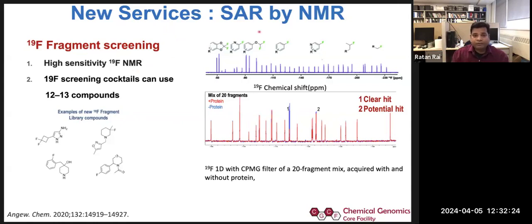So what do you mean by fluorine label? It means one of your sites has a fluorine over here. Like this is compound 1, it has fluorine over here. This has another example in which fluorine is here. So it is either attached to one of the ends.